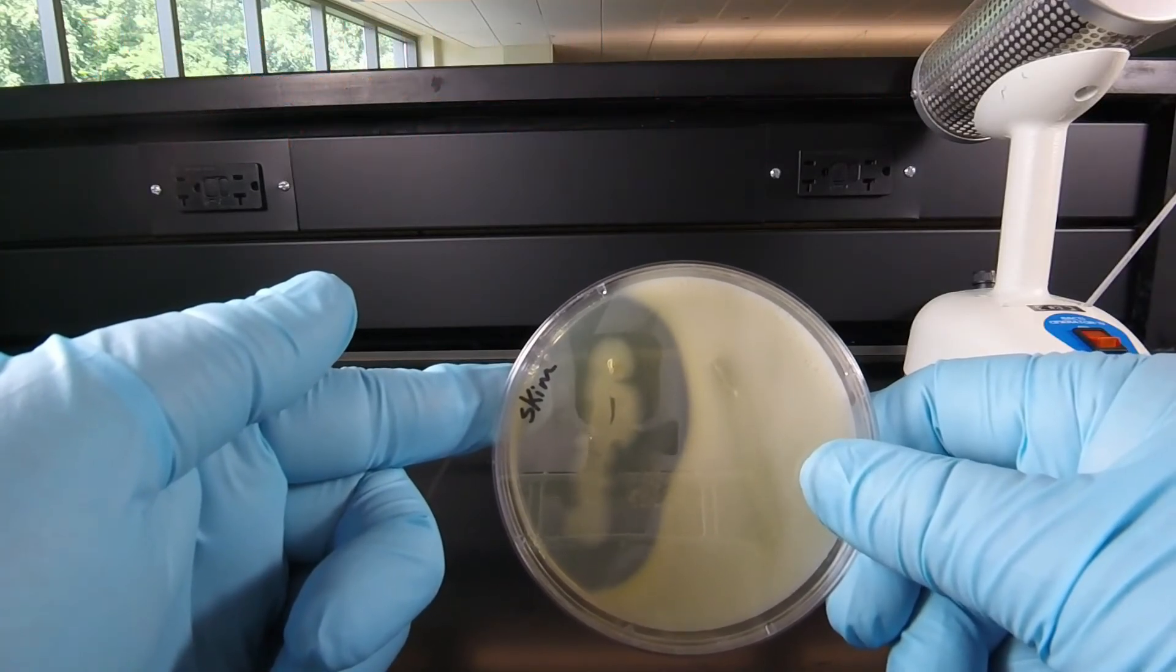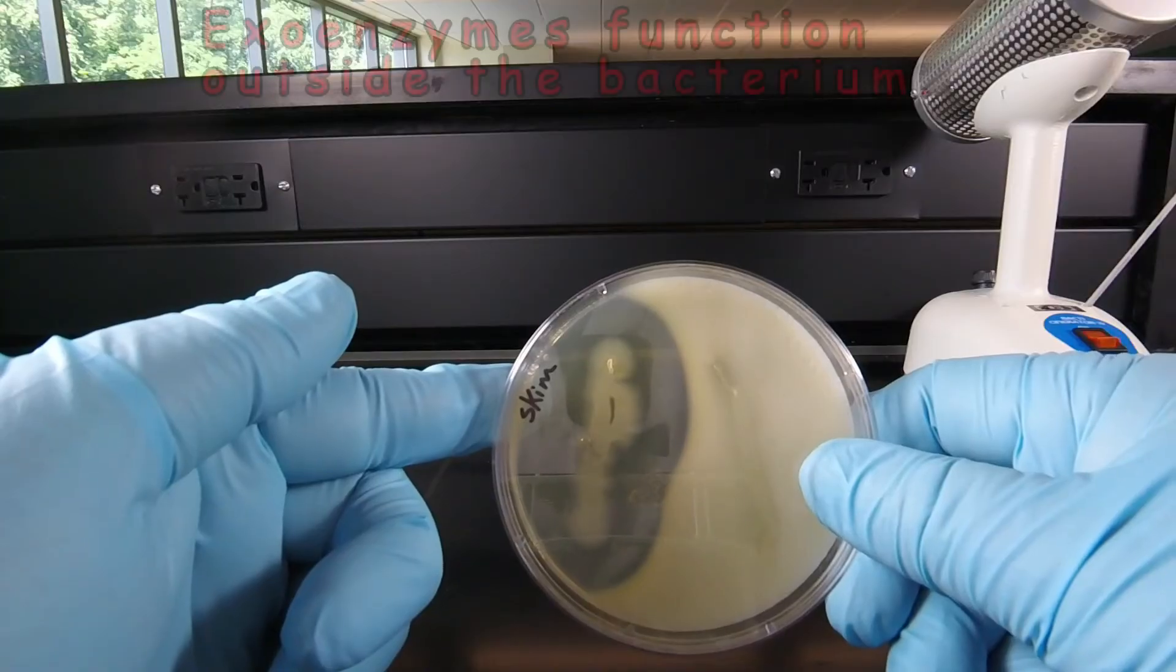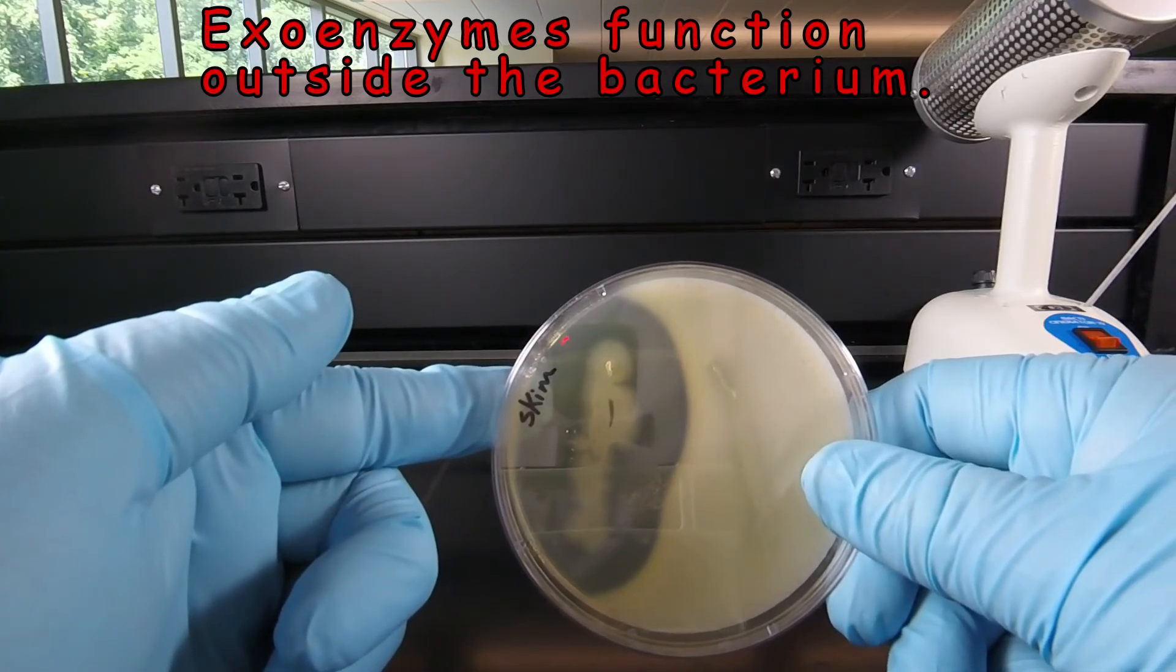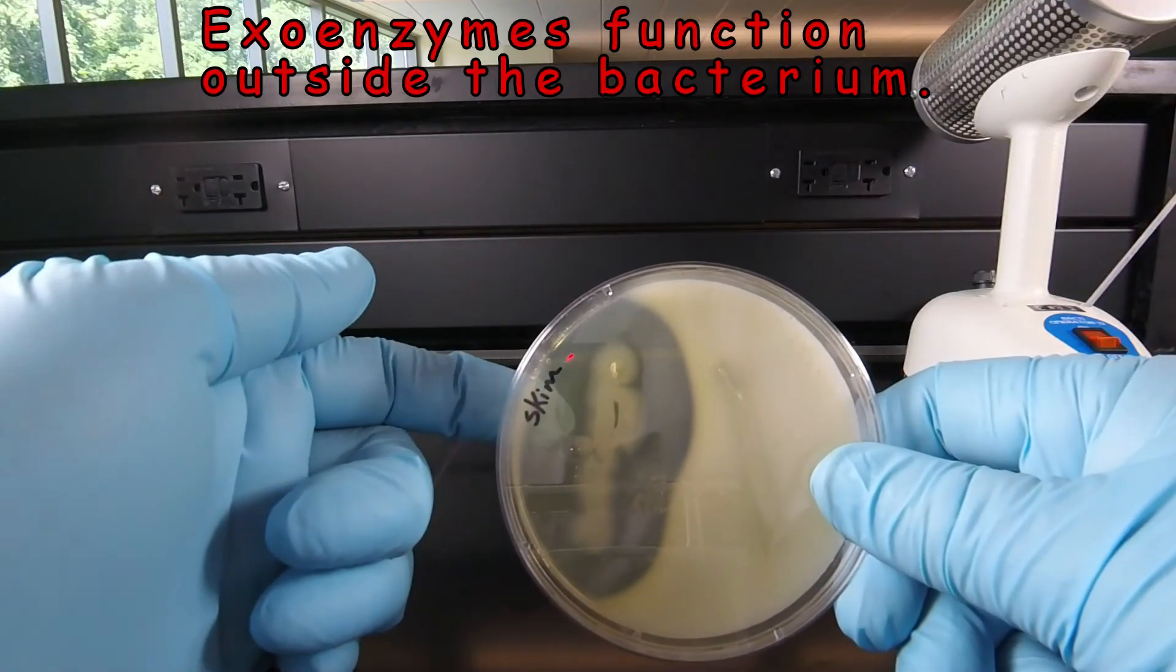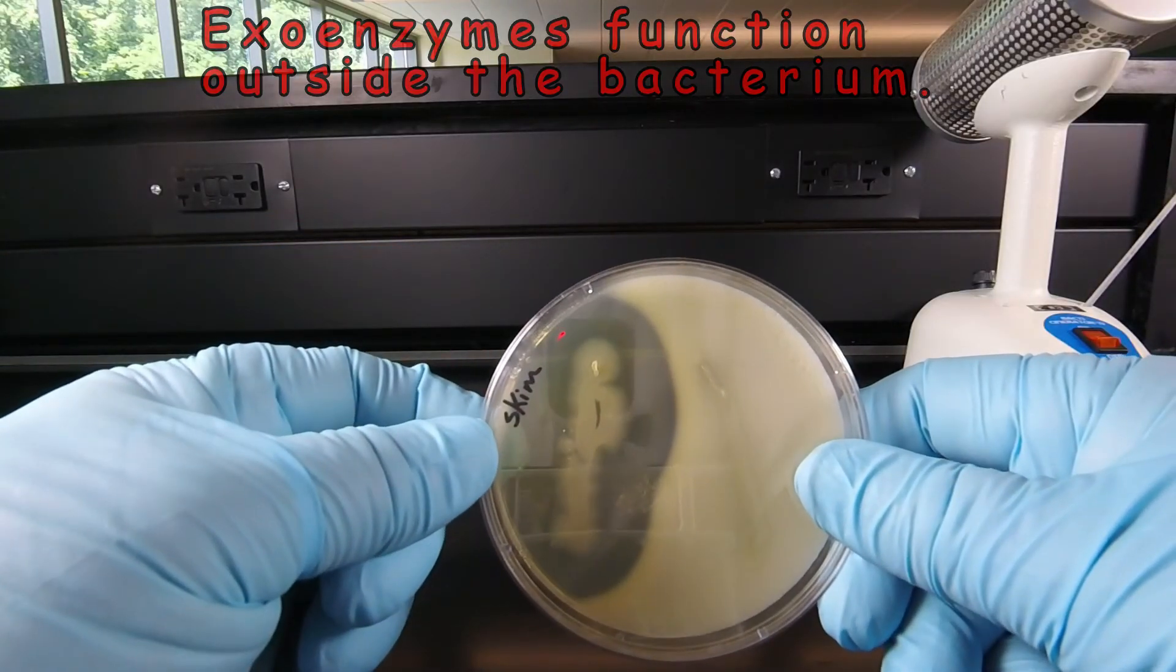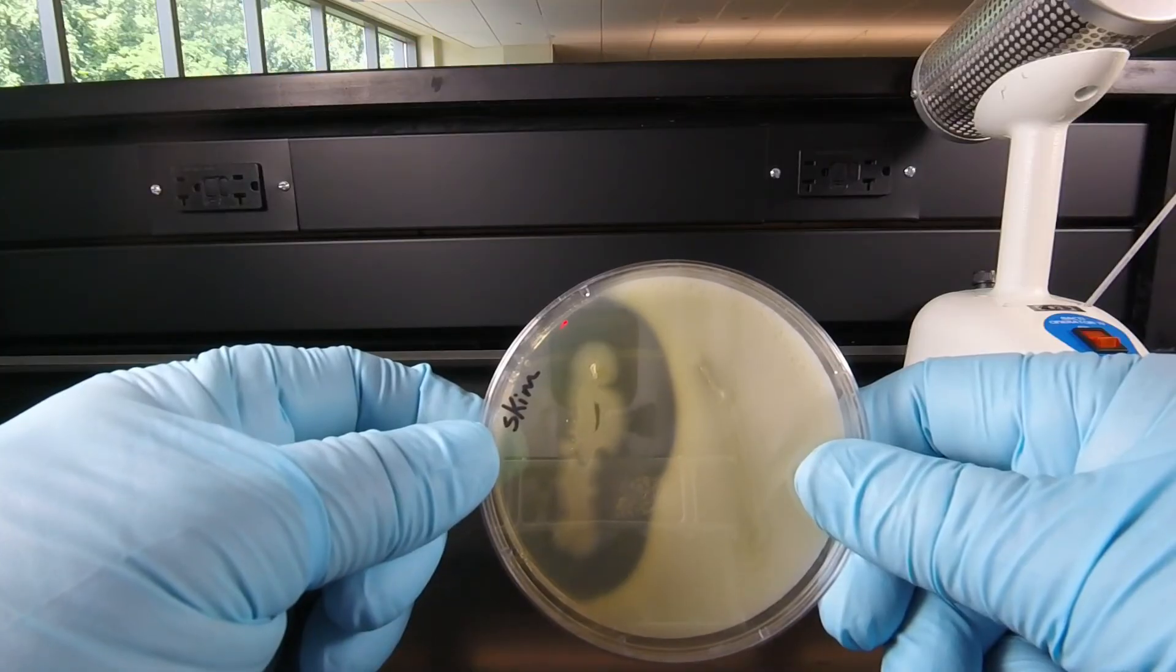So this is a nice demonstration of an exoenzyme that hydrolyzes protein, in this case casein. The enzyme was secreted by the bacteria, went out into the agar, and hydrolyzed the protein casein.